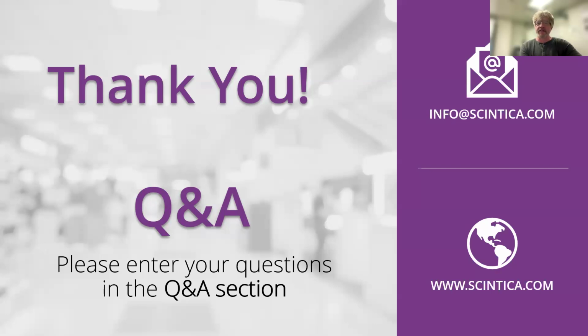That's the first place you're going to go: you request training, and then I will get back to you and we will discuss anything to do with your particular experiments. Regarding BSL safety requirements, we are a BSL2 certified laboratory, so you may bring animals there.